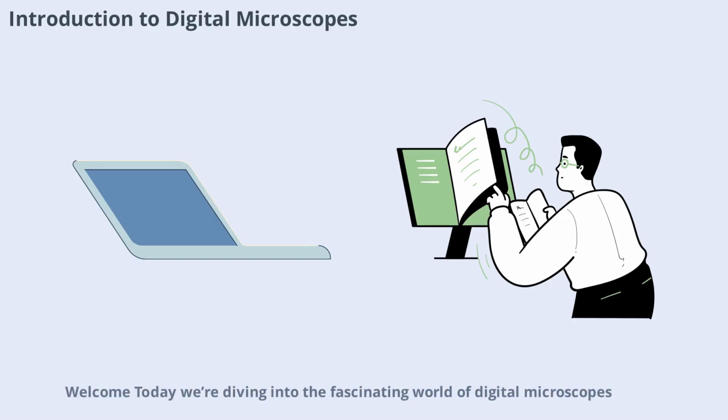Welcome. Today, we're diving into the fascinating world of digital microscopes. Unlike traditional microscopes, digital microscopes use advanced optics and digital cameras to display magnified images directly on a screen. This makes them incredibly user-friendly and versatile for a wide range of applications, from education to industry.